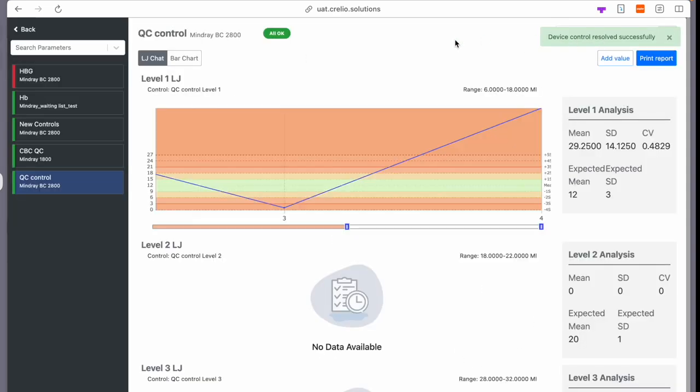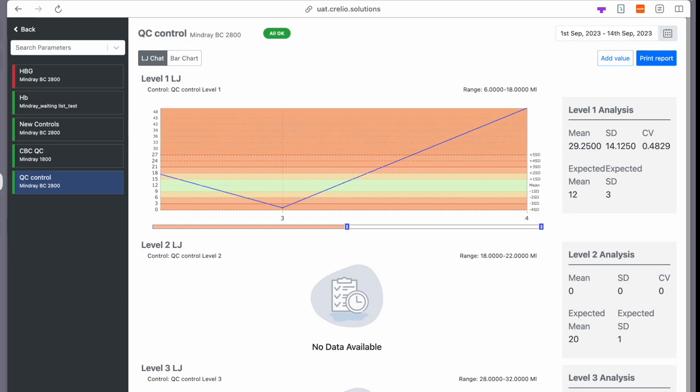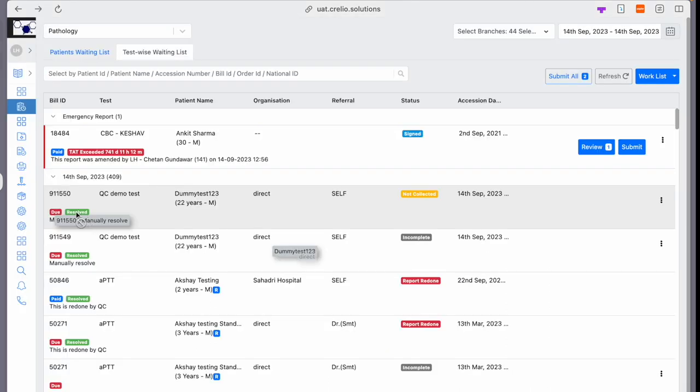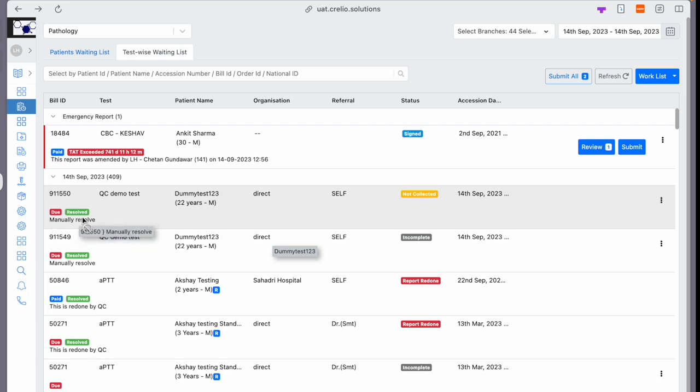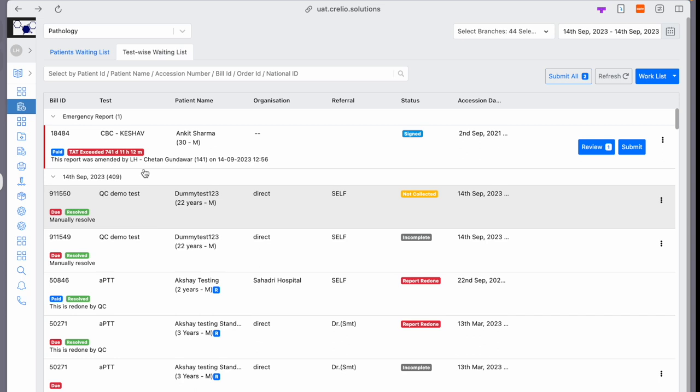been removed from on hold and all values are okay. And if I go back to the waiting list, it's marked as resolved, and the resolution comment is what I put while resolving the report. So this is how the new QC can automate your quality control processes and make sure that the reports which are delivered are correct and allow you to maintain your QC compliances.